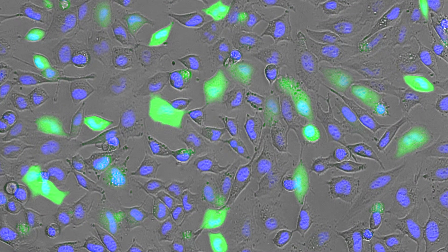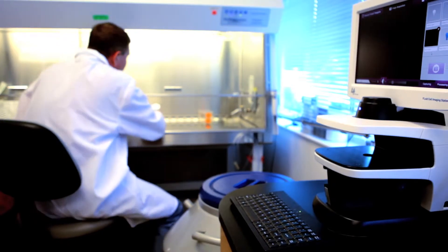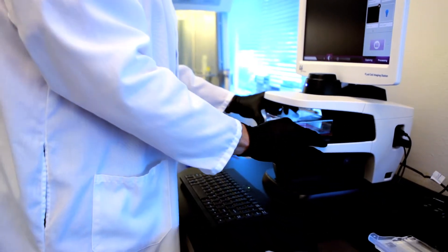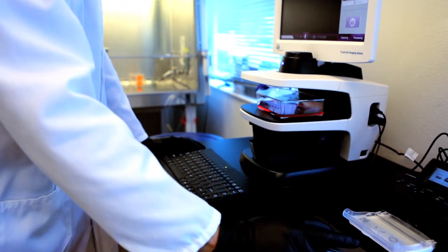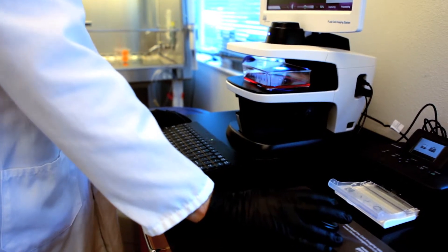Floyd works really well if you're routinely looking at GFP expression in mammalian cells, doing transfection experiments for example. Floyd's perfect for a tissue culture facility where people put it right next to the incubator, pop out their cells, take their image on Floyd, and they're right back in the incubator. They don't have to walk down the hall to get images.